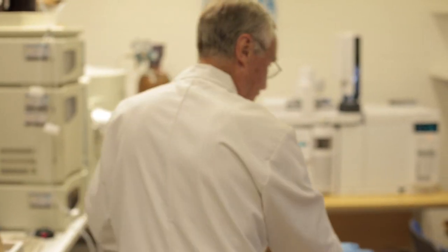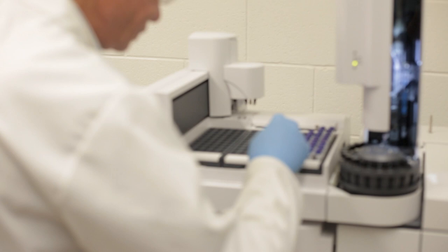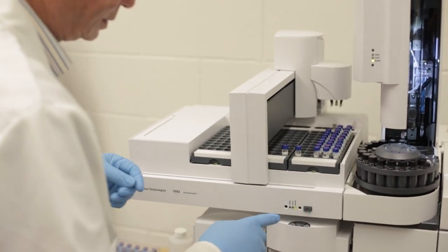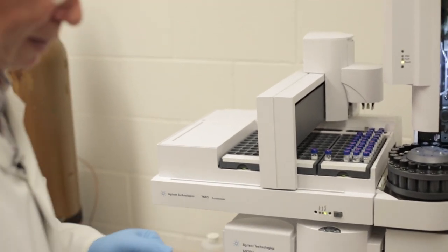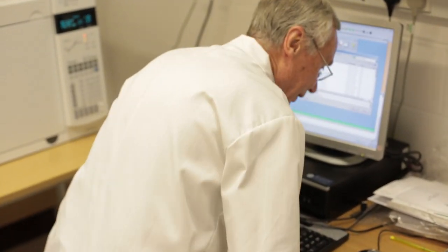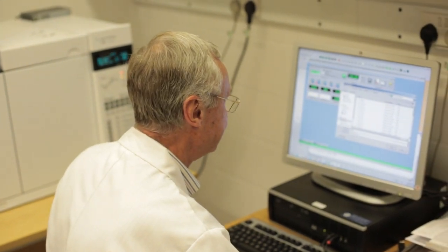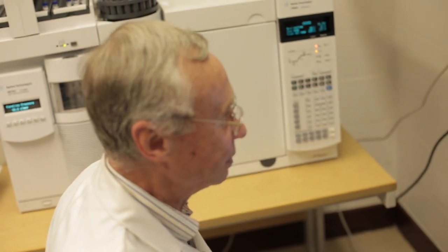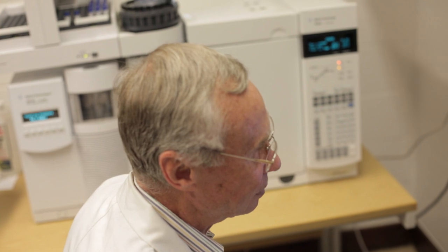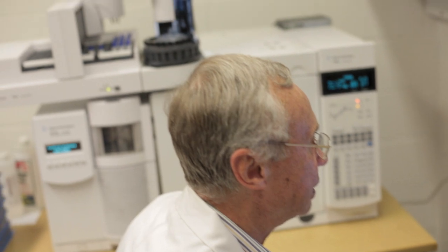So now we're going to put it on the mass spectrometer. Now what I do is need to do some entry on the computer. Okay. Now the machine is all set up ready to run the sample. It's going to inject a small amount of that onto the gas chromatograph which will separate it into its components and then produce a fingerprint of each of those components. So we'll tell it to run the sequence.